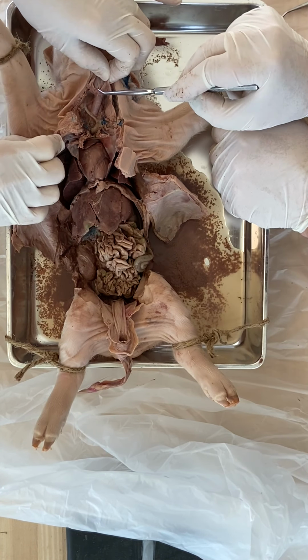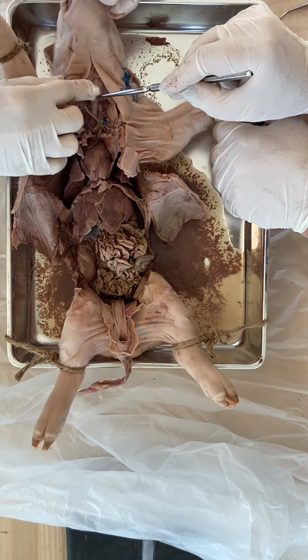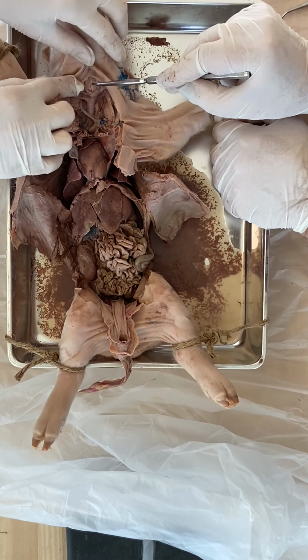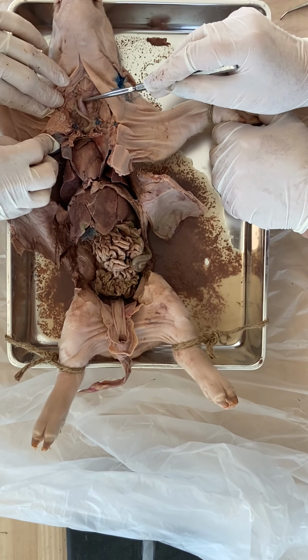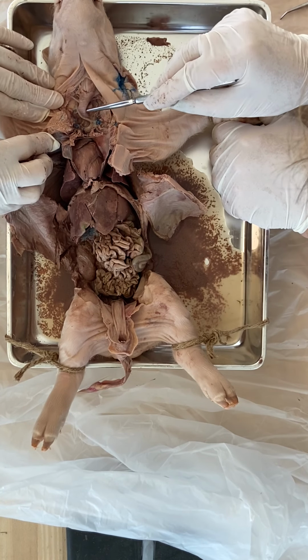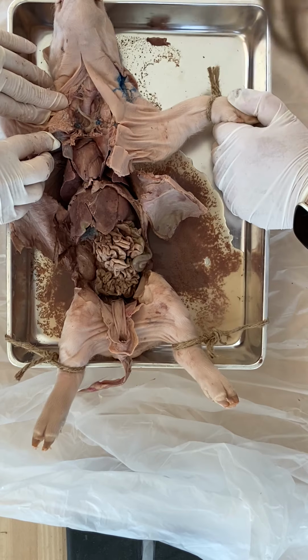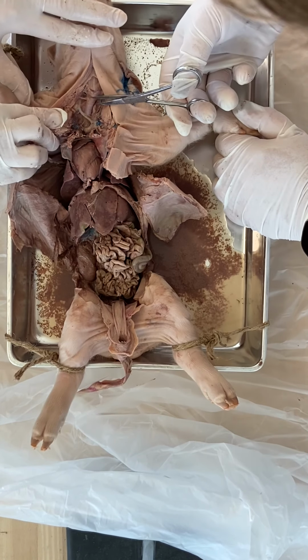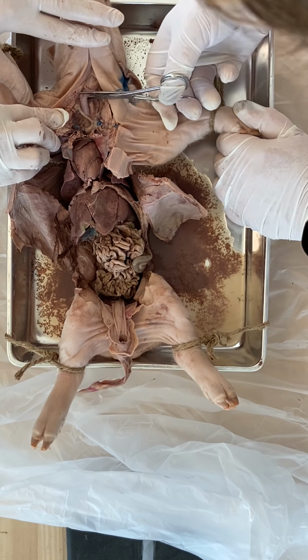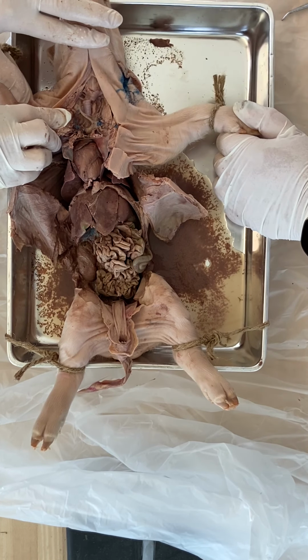Here we go. And there is the larynx up at the top of the trachea, with a nice cut through the middle of it, but never mind. He's dead anyway. And of course, behind the trachea... Shall we cut the trachea now? Is it still centered? It is. Yes, we'll cut the trachea now so we can look at it end on. I always think that's a good view. There we go.